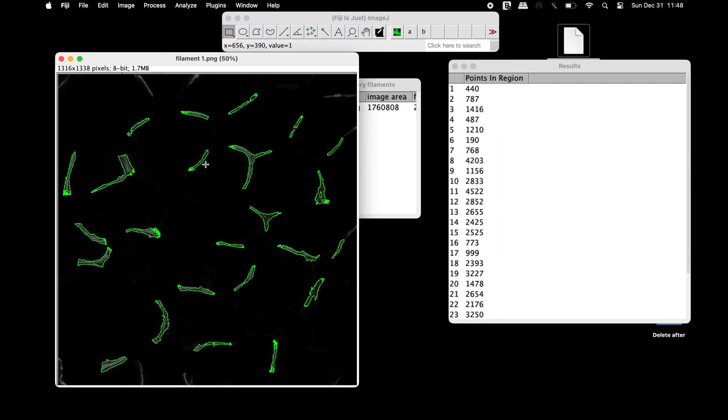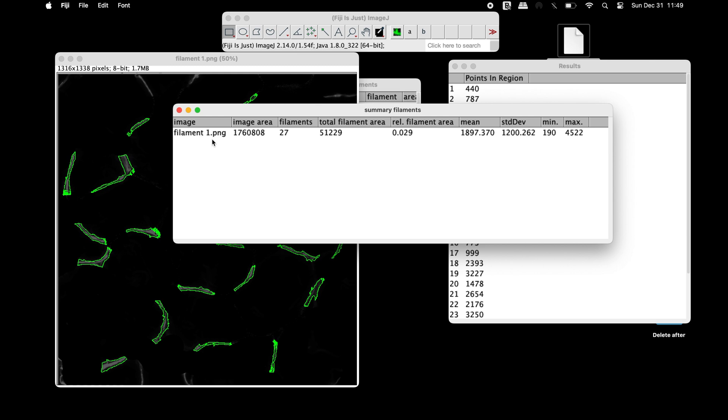The output image contains the filaments with outlines. In the Summary Filaments window, information can be obtained for the total number of filaments, total filament area, and other data like mean and standard deviation.